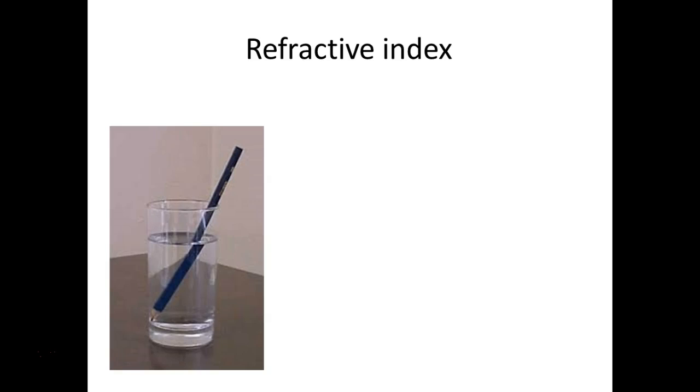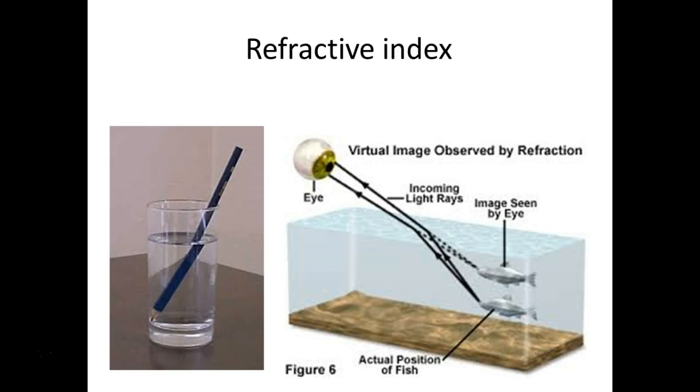So this comes into the problem, too. If you want to go spearfishing, you're better off getting in the water, because you're in the water with the fish, and so therefore you're seeing it through the same media. You're both in the water. If you're trying to nail a fish from out of the water, you're dealing with refraction of light. So you think he's here, right? But he is actually down here, because that image, just like this one, is distorted because of the speed of light through water versus air.